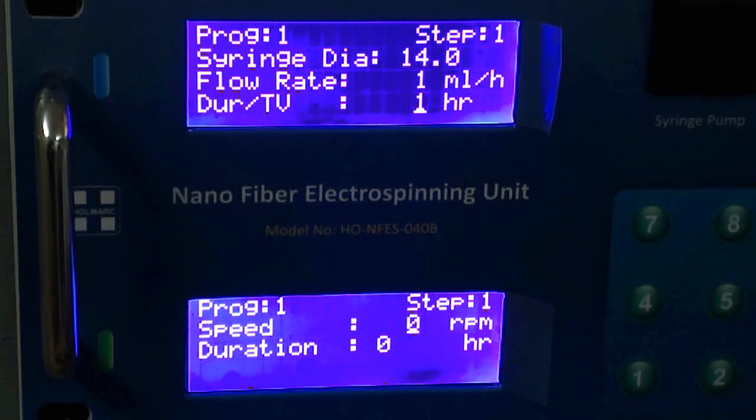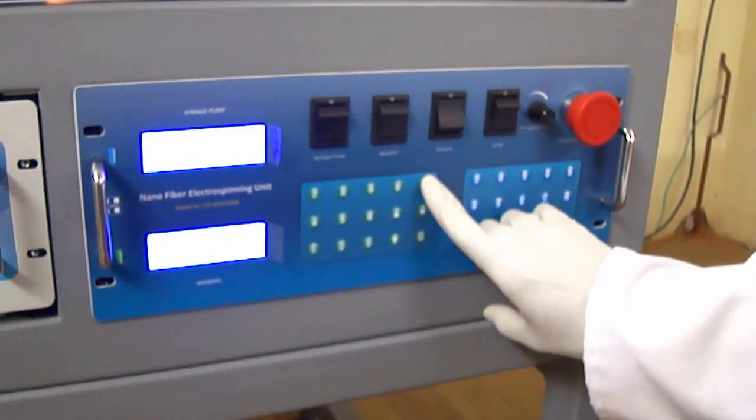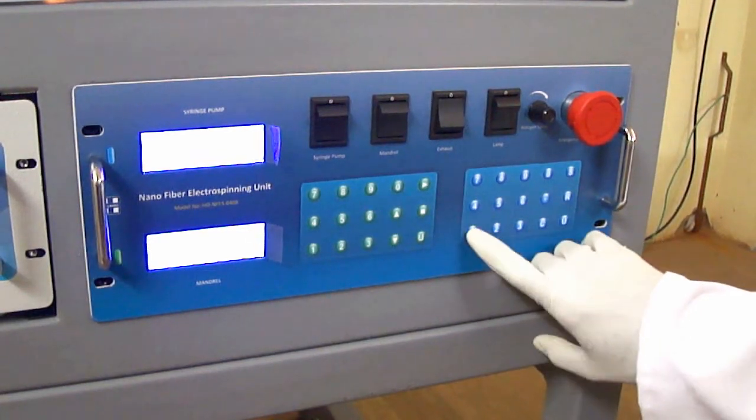They are user-friendly in design, and can be used for entering all process parameters, such as speed of syringe pump, speed of mandrel, duration, flow rate, etc.